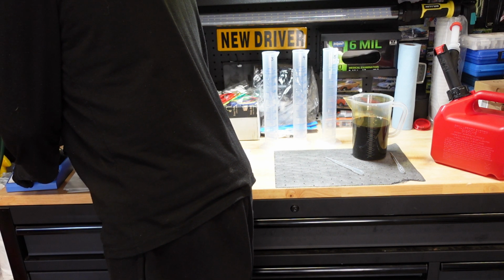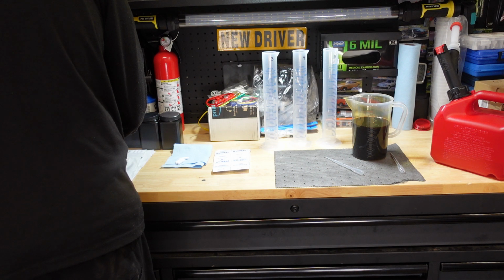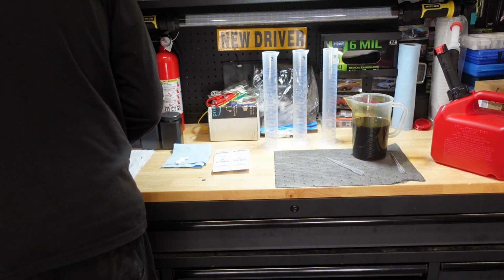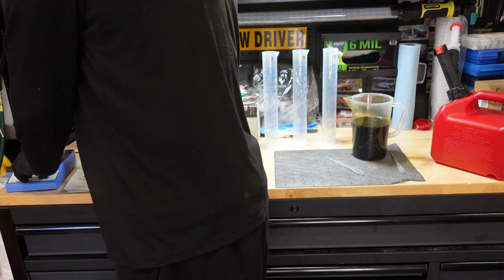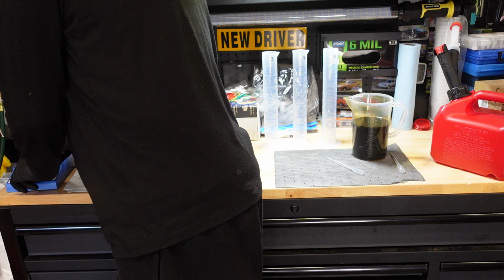Matter of fact, hold on, let me make sure of this. Yeah, because the stir plate might just not be powerful enough for how thick this oil is. Let's see. No, max settings. Turn it back down for a second here.